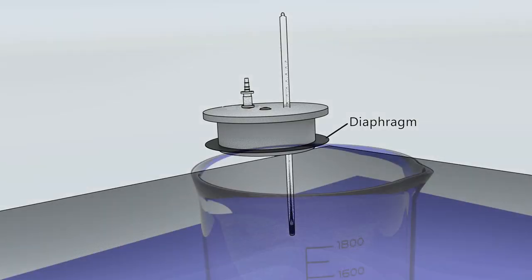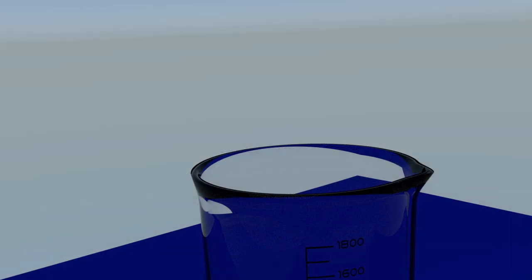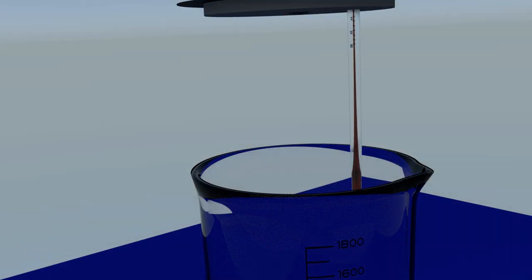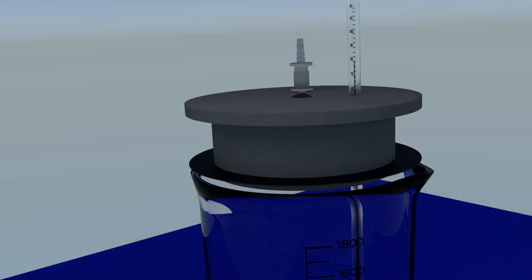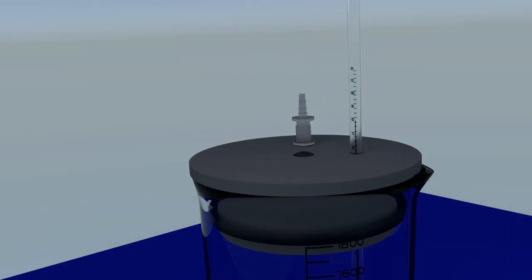The diaphragm forms a tight vapor seal with the edges of the beaker. It flexes to form a tight seal despite the variations in beaker dimensions from brand to brand and beaker to beaker.